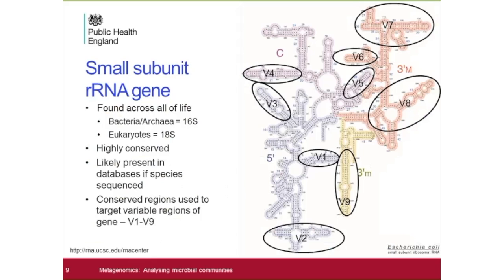The next challenge is, as I show on this slide, this is the standard familiar sequence in two-dimension of the 16S loci. And as you can see on the gene, there are areas that are constant and there is no variation between organisms, and there are regions that now we define them from V1 to V9 that are variable. And it's within this variability we can detect markers for various classes of bacteria, genera, and species.